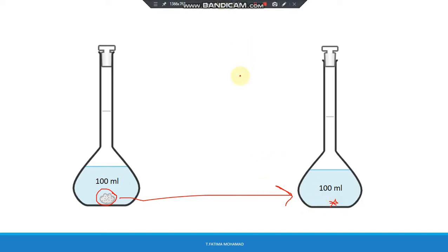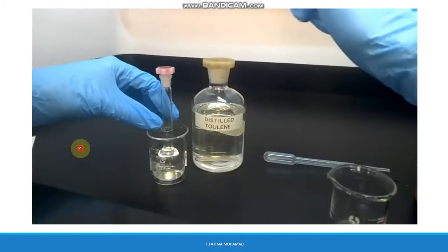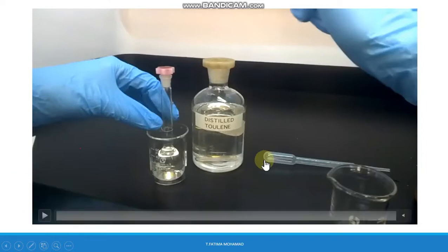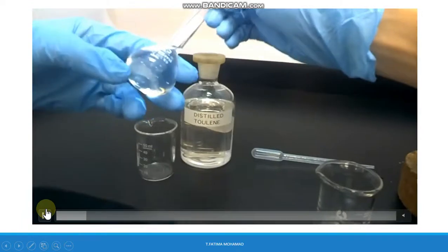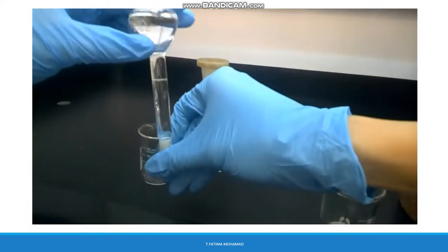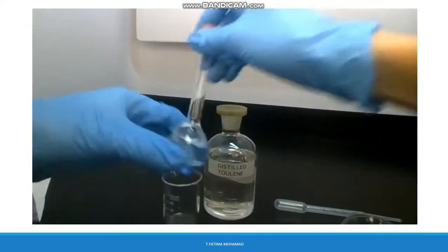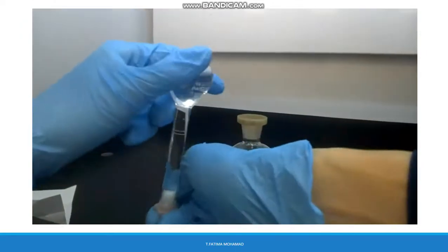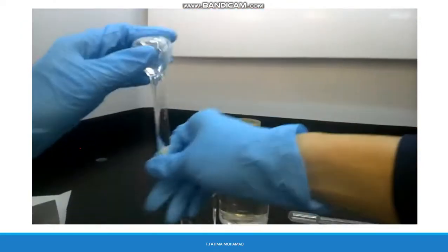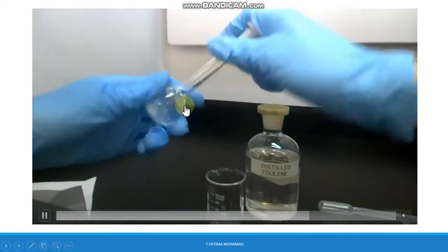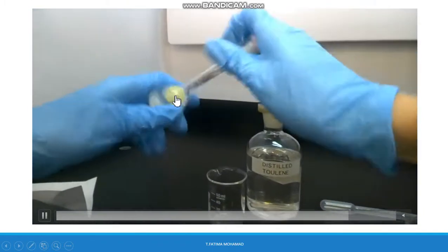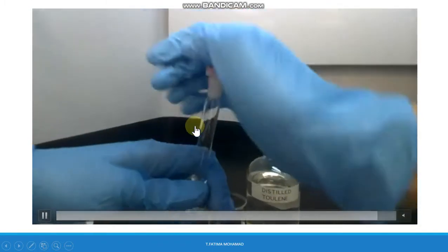A video demonstrates how to shake the volumetric flask. First, seal the volumetric flask using a stopper. Then, holding the stopper firmly with one hand, turn the flask upside down repeatedly. If some solid solute still remains, repeat this procedure until all the solid is dissolved and disappears completely.